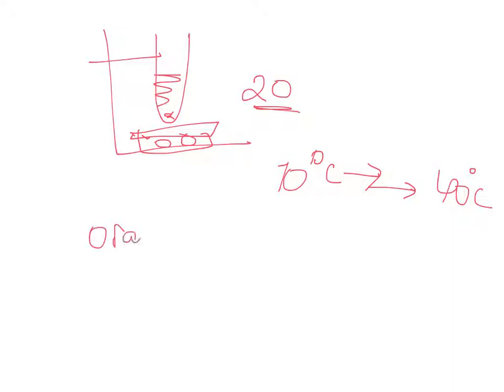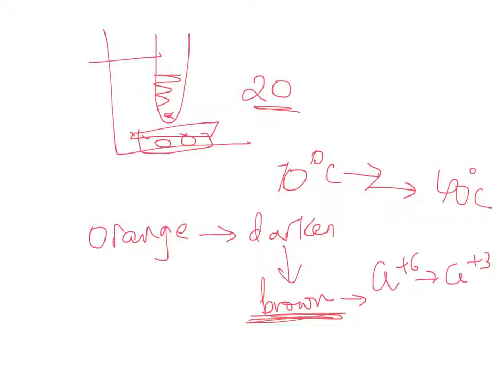You'll see that the orange color you started with will start to darken—you'll get a very dark brown color, almost so dark it's difficult to say whether it's brown or green, but it won't be orange for sure. That tells you the reaction is taking place, majority of your product is getting formed. As the alcohol undergoes oxidation, the chromium goes from Cr+6 to Cr+3, and Cr+3 is green in color. That's why the orange-green transition happens.